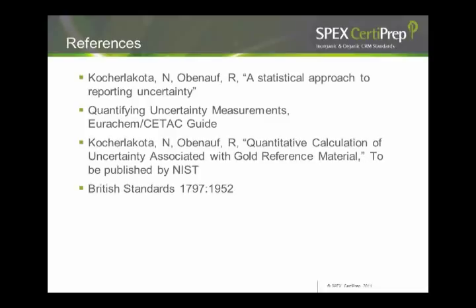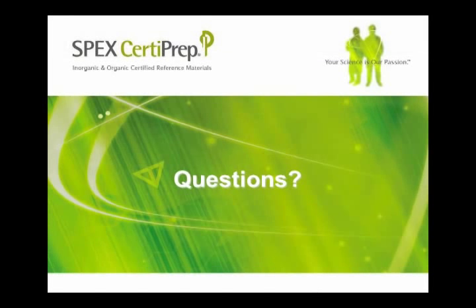So now what do we have? This represents uncertainty from each component. As you had seen, uncertainty for SRM prep had its own components. We pooled uncertainty from each of those individual components, and finally we calculated, as for standard prep, the relative standard uncertainty. We took a similar approach for sample prep, and there were quite a few individual components to this, and we pooled that and we got this value. Now, the uncertainty for SRM measurement is pretty straightforward, and same thing for uncertainties for sample measurement.